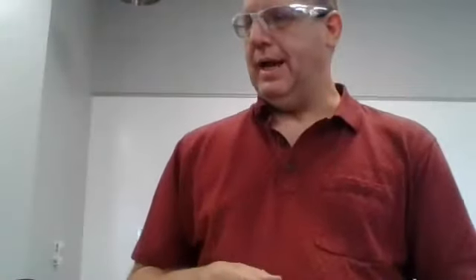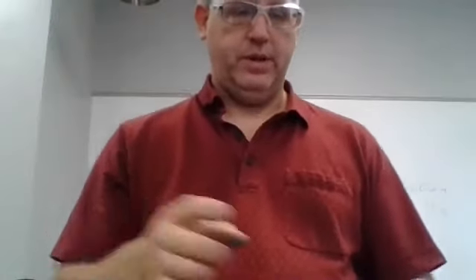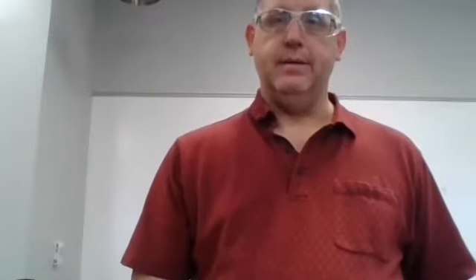In order to get to this range, I am going to take a half a milliliter of this, and I am going to dilute that into 100 milliliters. Okay, so with that, I am going to pause for just a second, get these little solutions mixed up, and you will have just a pause in the recording.